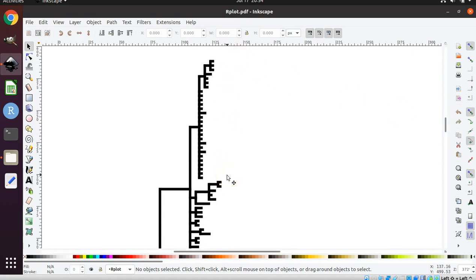That would make it a pretty crowded figure to use in a publication. Instead, what I will do is highlight each group with a different colored line. But there's a myriad of other different ways you could do this. You could make colored boxes that are somewhat transparent that you put over the different groups, or something like that.